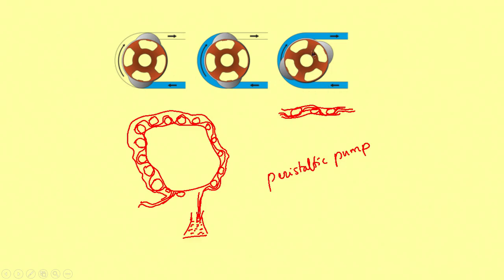Here these are all ball bearings, you can see these black systems on the top. Near the top there is a ball bearing, there is one more ball bearing here, there may be more also. So, these are three different stages where the liquid is sucked in and delivered.